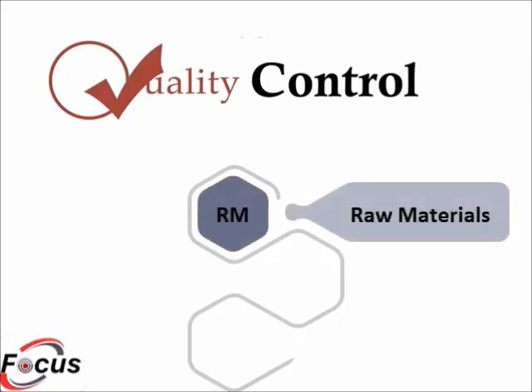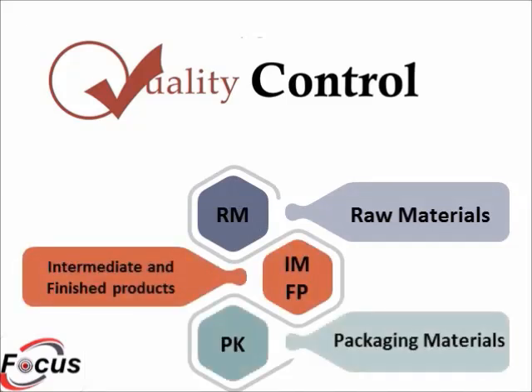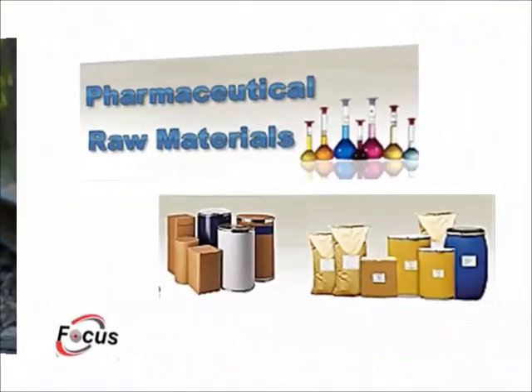1. Raw materials testing. 2. Intermediate and finished products testing. And 3. Packaging materials. Let's start our journey. First one is raw material.